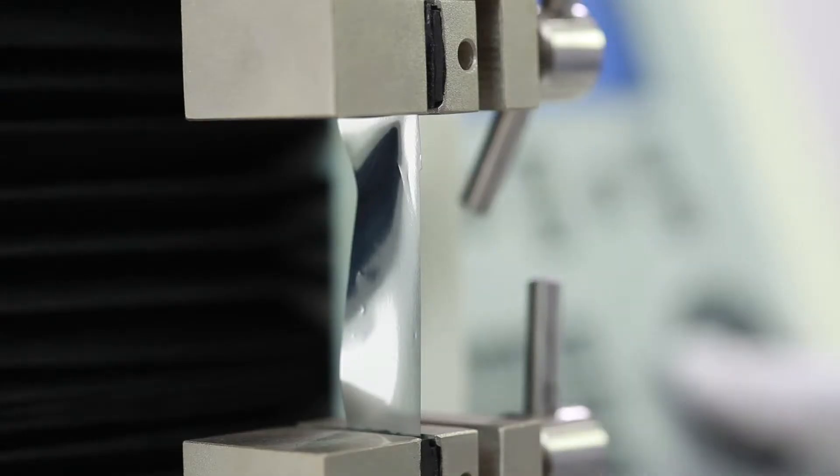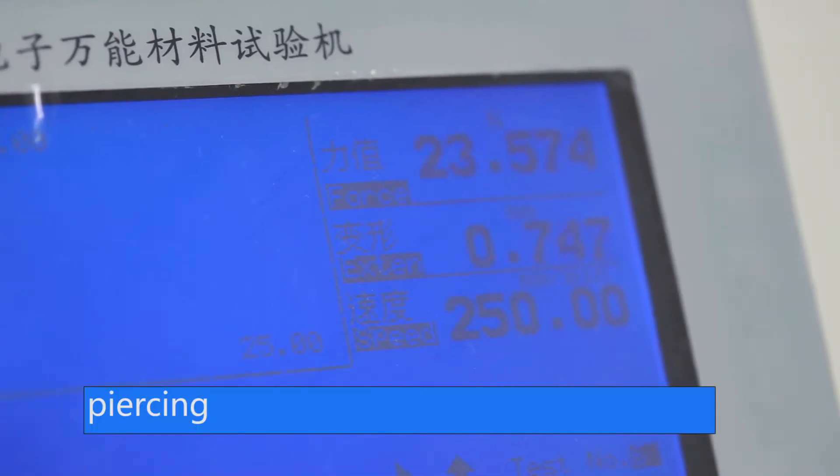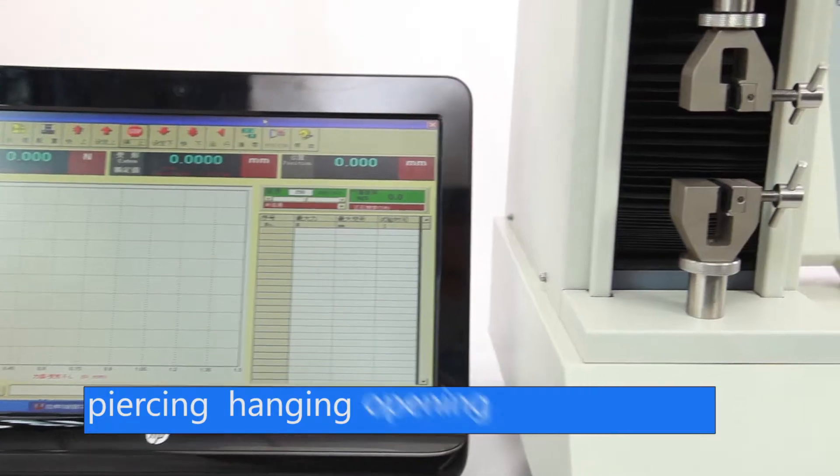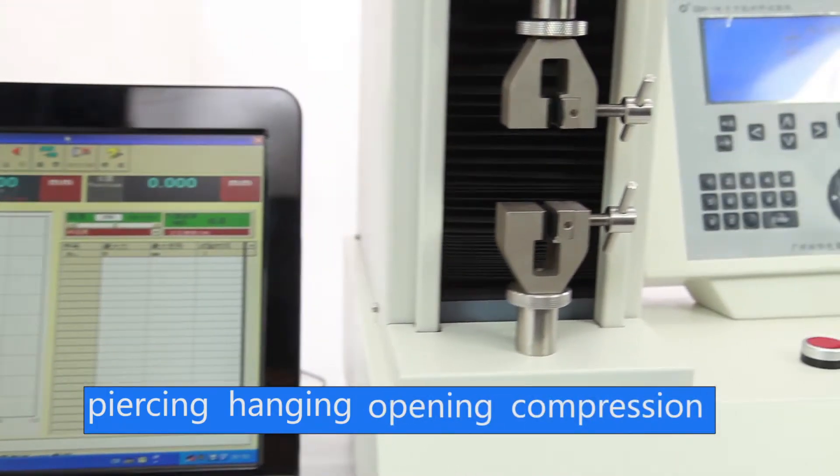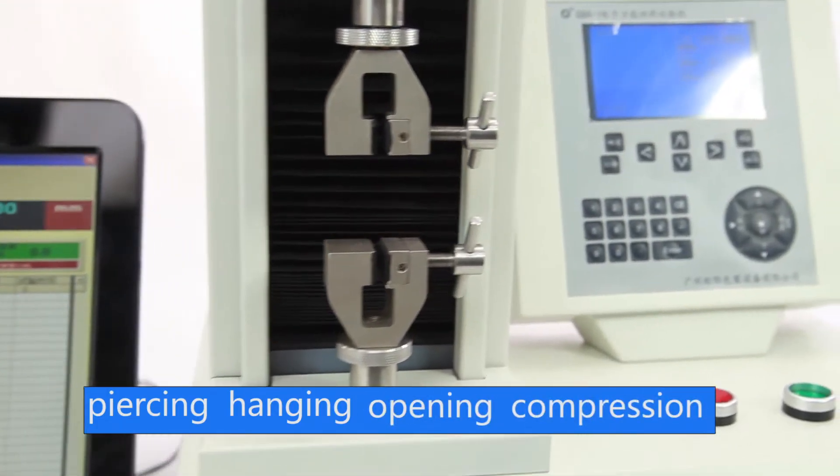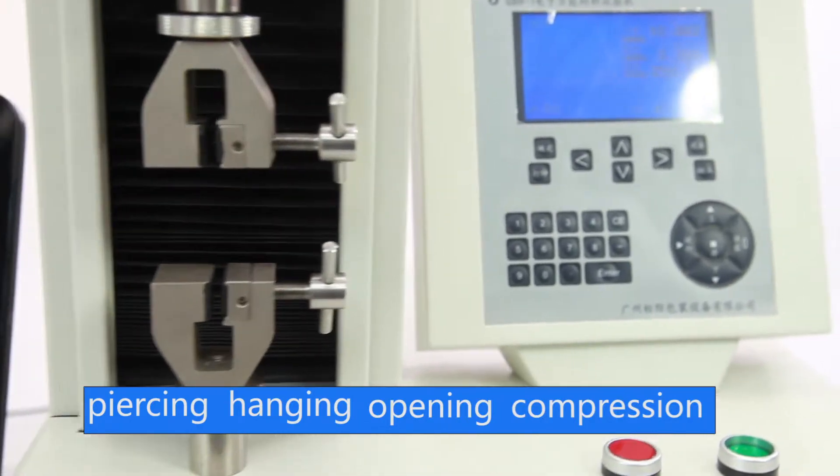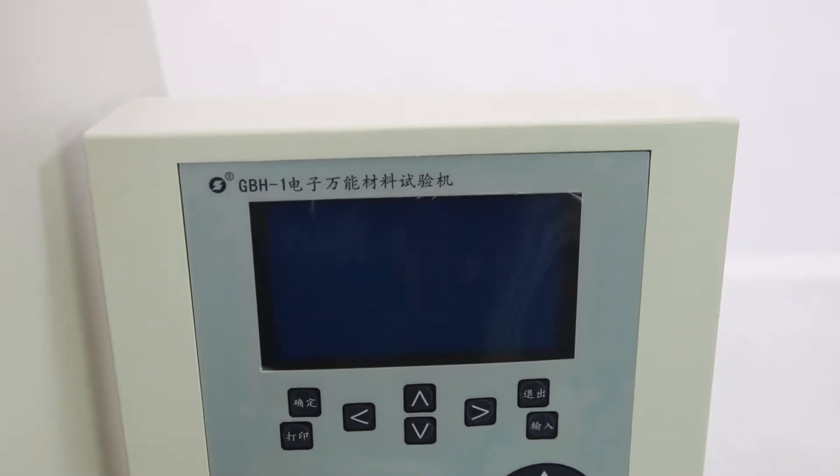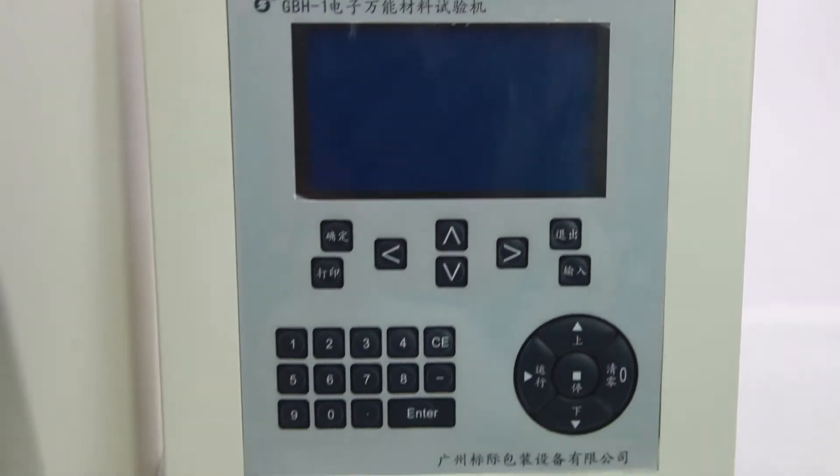It also tests strengths, piercing, hanging, opening, and compression of medical infusion bag, film, bottle cap and so on.